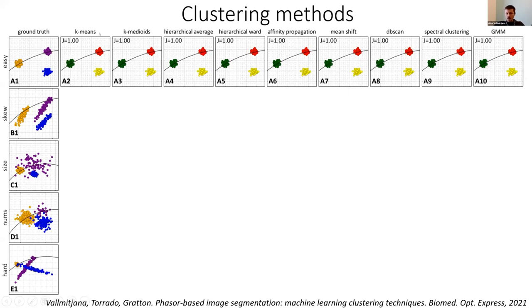So you may have heard of k-means. K-means is probably the most well-known of the clustering methods. It is based on distances. Given a certain random grouping, you find the mean position of all the elements in that group and then measure the distance of all the elements to that center. So you basically want to minimize the distance to the center of the group while maximizing the distance among groups. There are other techniques based on connectivity and graph theory, based on local density. DBSCAN is a well-known one, which is based on density. Mean shift is a weird one where you throw a grid and then you shift the points on the grid to match the most elements in your space. And then these are more modern techniques.